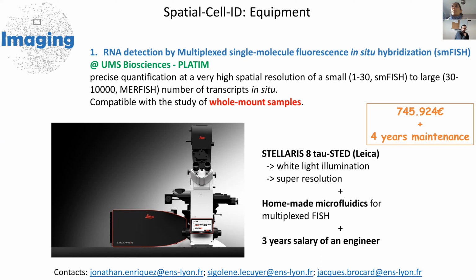We also have a little bit more than 20K to build a homemade microfluidic apparatus. As I told you, for MERFISH you need to do multiple rounds of hybridization. And of course, you're not going to do that manually.